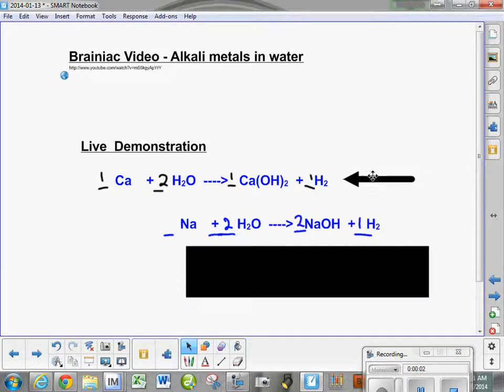What we want to see is this reaction right here of calcium reacting with water. So the calcium here is what? A metal or an ion?